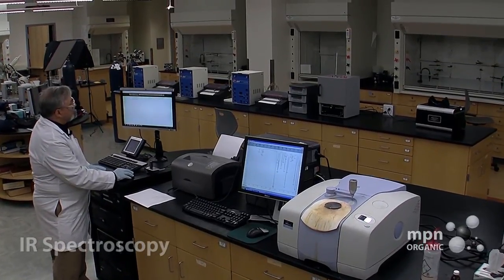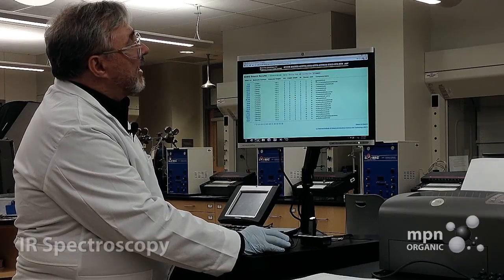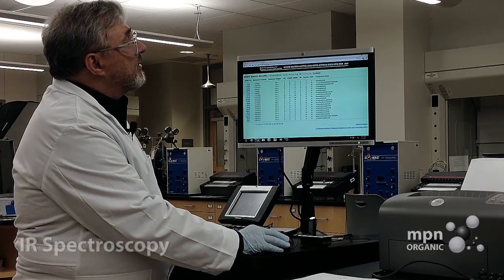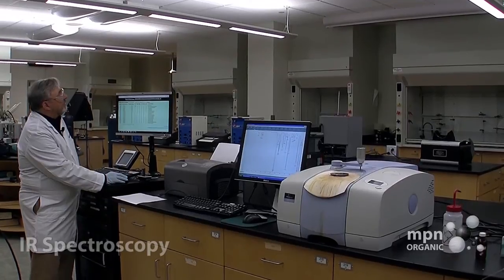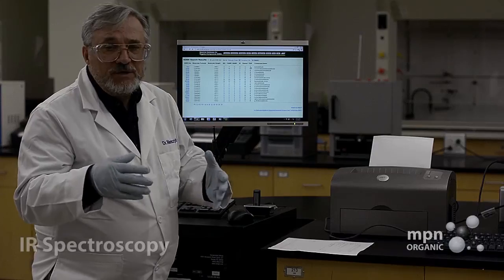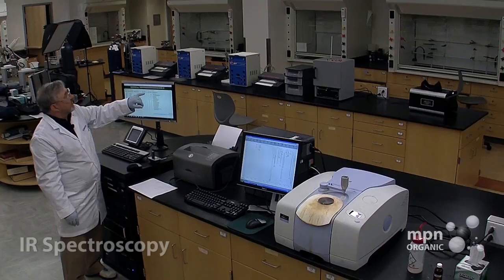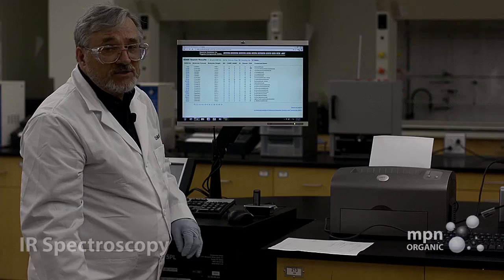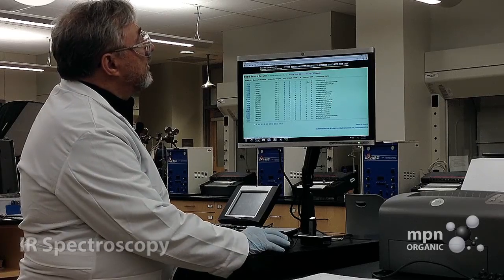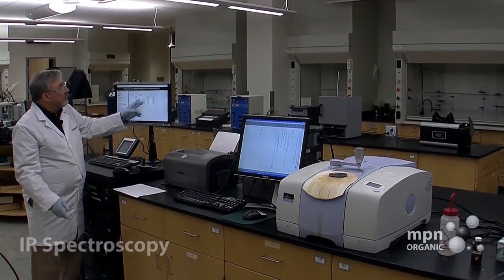And then here we have a whole list of compounds, one of which is benzaldehyde. There are others that are related to it, but here's benzaldehyde right on top. And wherever you see a Y, that means that there is that type of spectrum available. So for benzaldehyde, we have a mass spectrum, a C13 NMR, a proton NMR, an infrared spectrum, a Raman spectrum, and an ESR, or electron spin resonance spectrum. And so we're just going to click on IR.